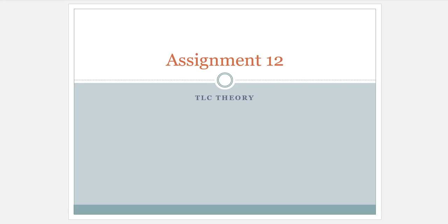Okay, in this assignment and in this lecture video, we're going to continue on our theory of how a TLC plate is working, how does it develop, what's going on with the HPTLC instrumentation that allows us to do this a little bit easier and a little bit better. And the first thing that we're going to mention on this little mini journey together is the chamber configurations. So what's going on inside of the chamber?